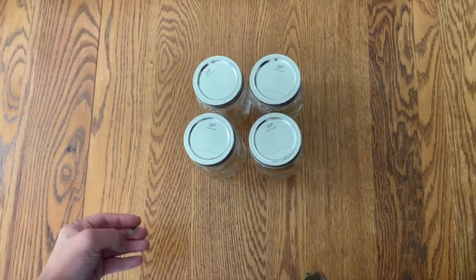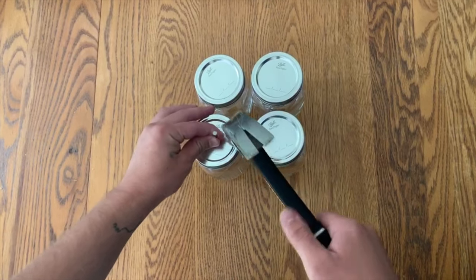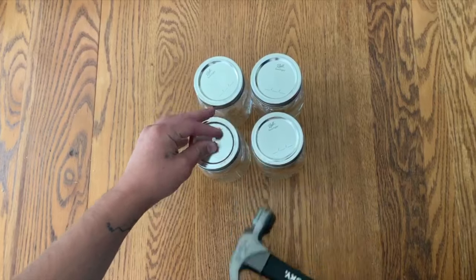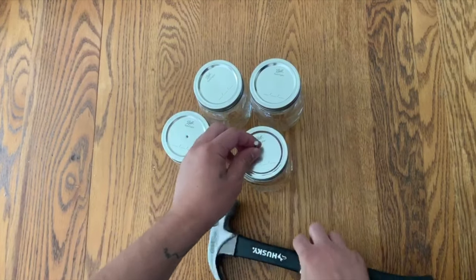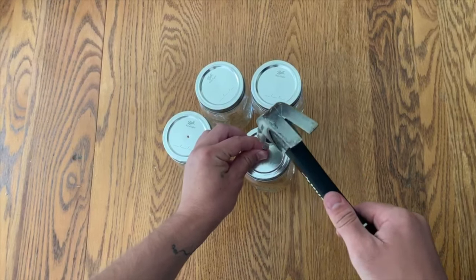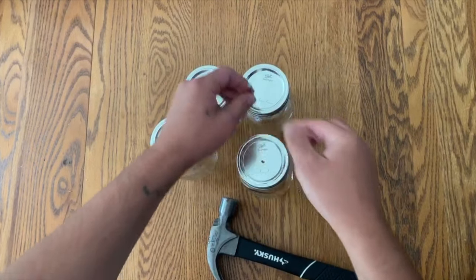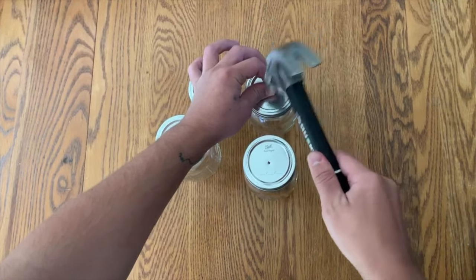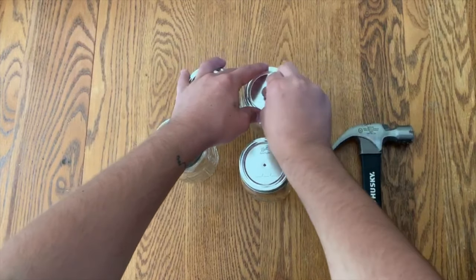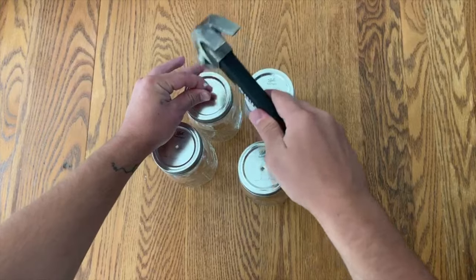The first step is pretty simple. It involves poking a hole in the center of your jar lid with the hammer and nail. The purpose this serves is an inoculation point for your syringe to enter the jar. You can use any size jar that you want — in this video I'm using pint sized jars.